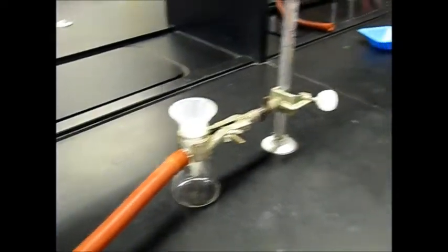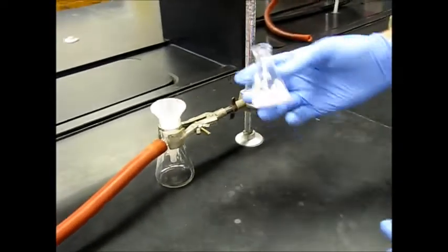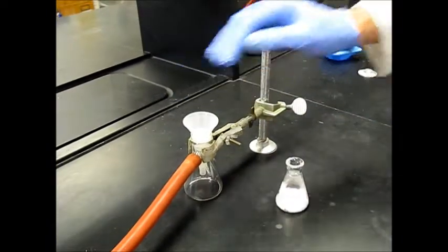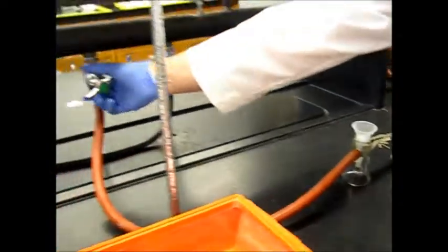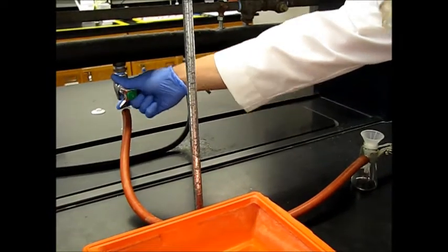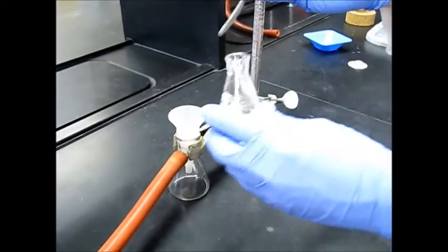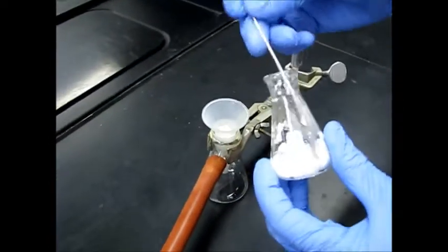Cool. So now we're going to dump all of this stuff into our little funnel. All of the liquid should come out, and we'll just have our solid up at the top. So go ahead and turn this on for the vacuum. Then we can help get all that solid out with our spatula.